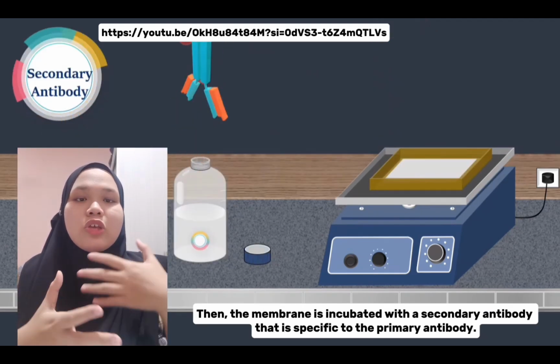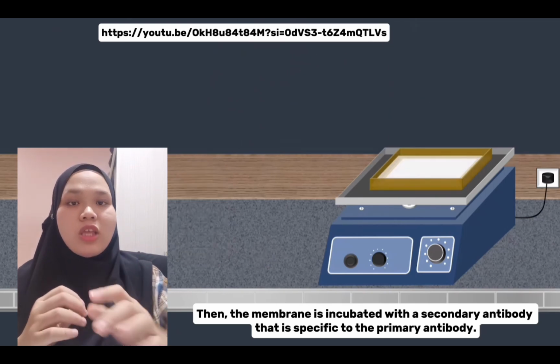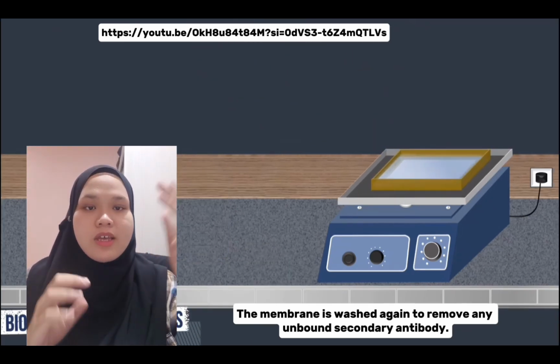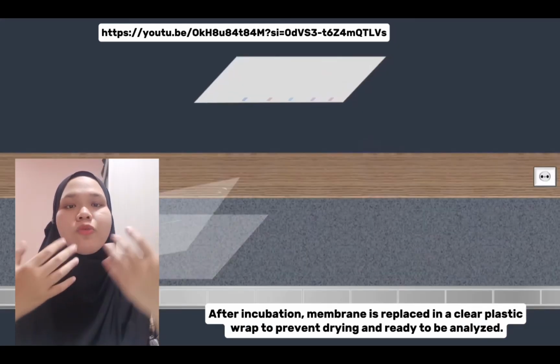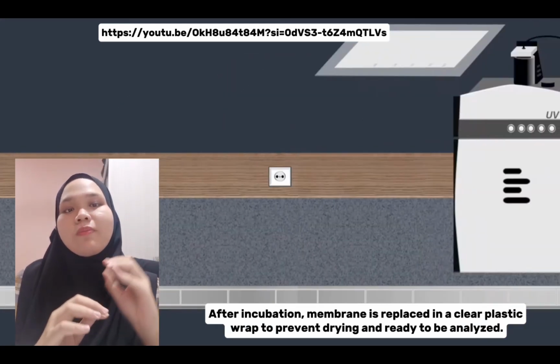Then, the membrane is incubated with a secondary antibody that is specific to the primary antibody. The membrane is washed again to remove any unbound secondary antibody. After incubation, the membrane is placed in a clear plastic wrap to prevent drying and is ready to be analyzed.